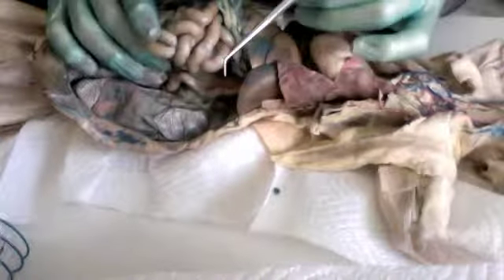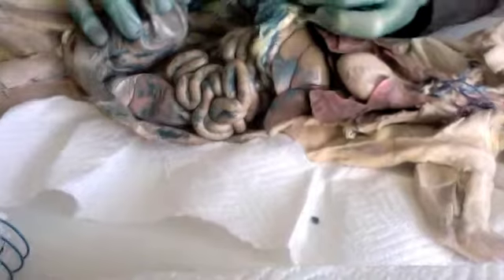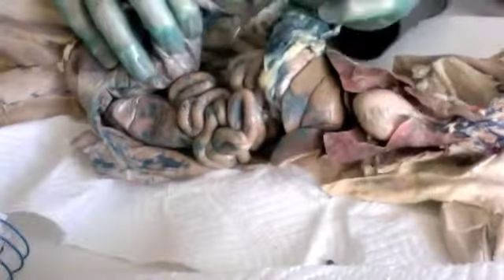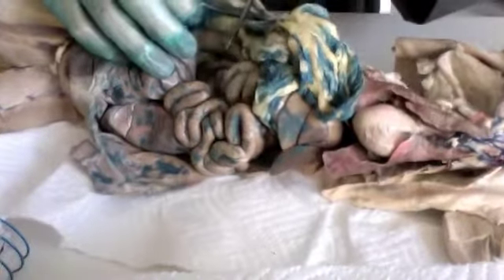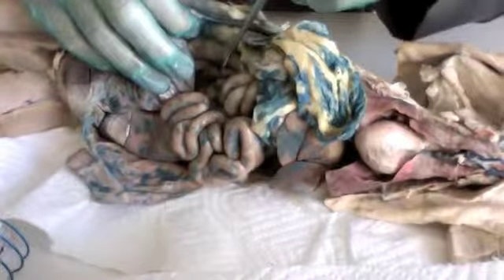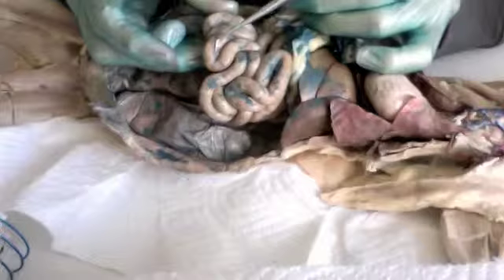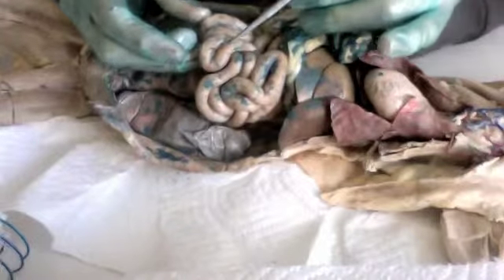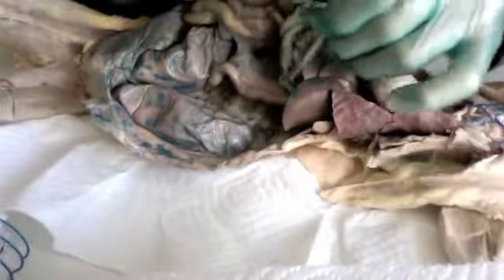And then we have the cecum. Cecum's on the other side. Here. Sorry, this lines up with the spleen. And this is the cecum. And then we have the ileum. And the ileum is located right here. This is the ileum. And we have the ascending colon. Ascending colon is here.